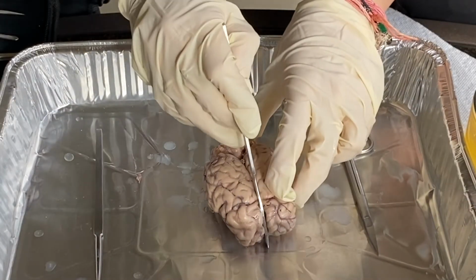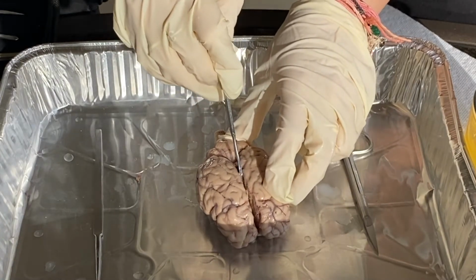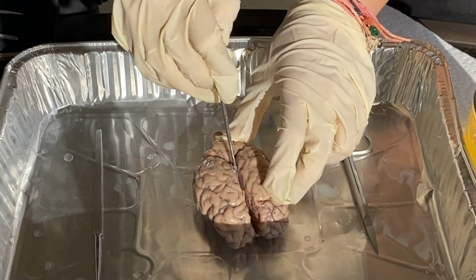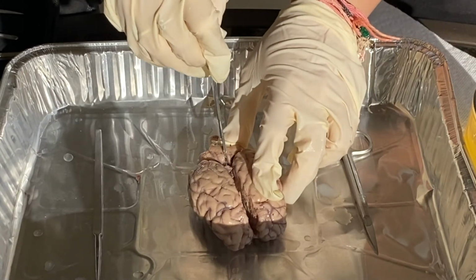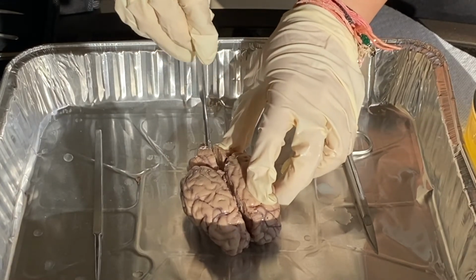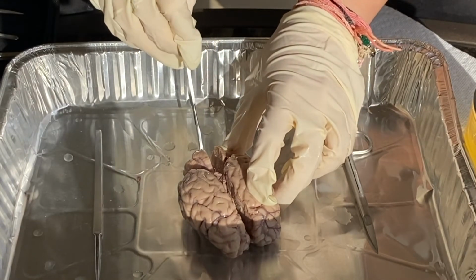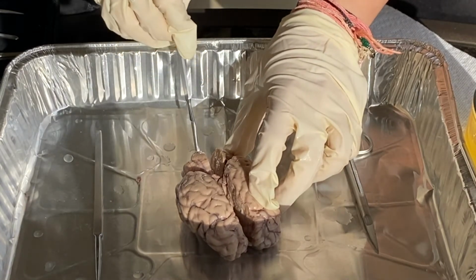I'm going to dissect the brain sagittally across the mid-sagittal plane, and I'm going to go through in between both of the hemispheres, and then also the cerebellum, and then back through the spinal cord, so I can identify all of the internal structures.